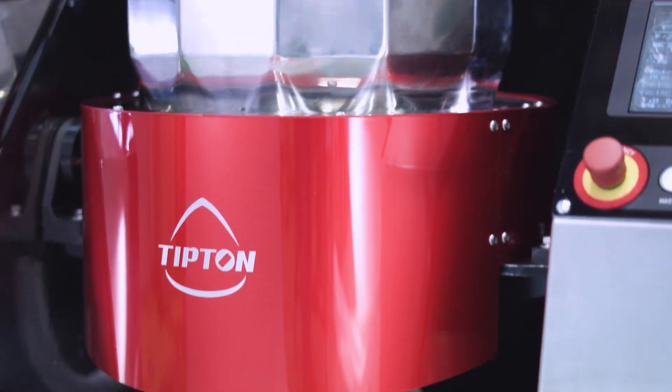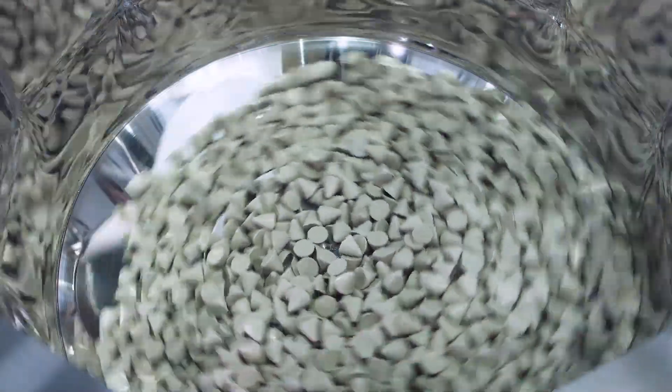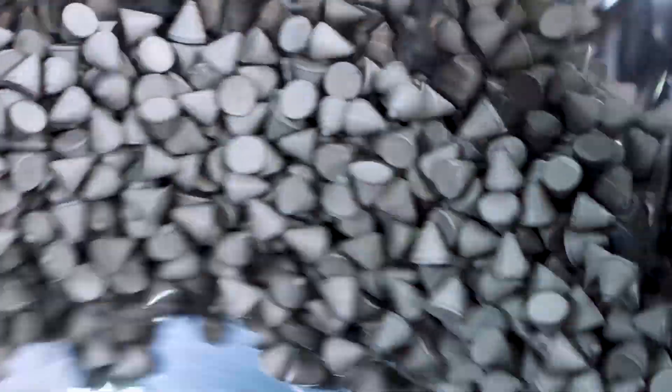We are proud to introduce our ECXPs, a multi-purpose processing device that handles everything from mixing, granulating, sizing, and coating, to parts polishing, all in one device.